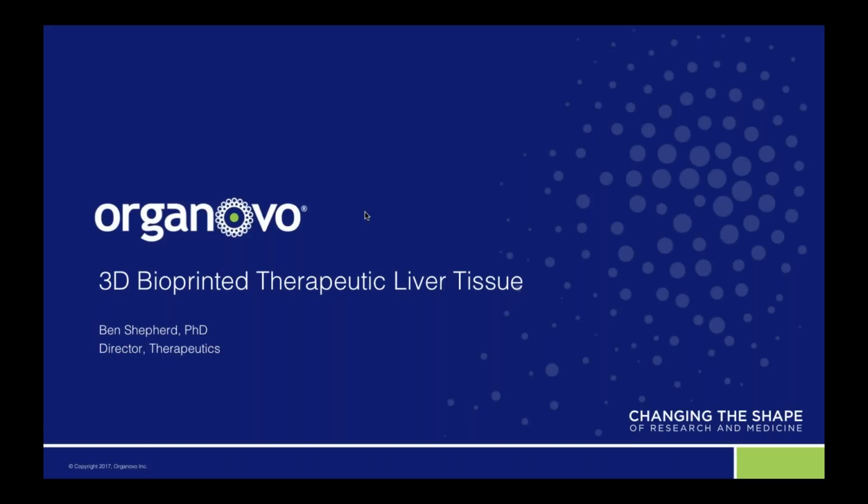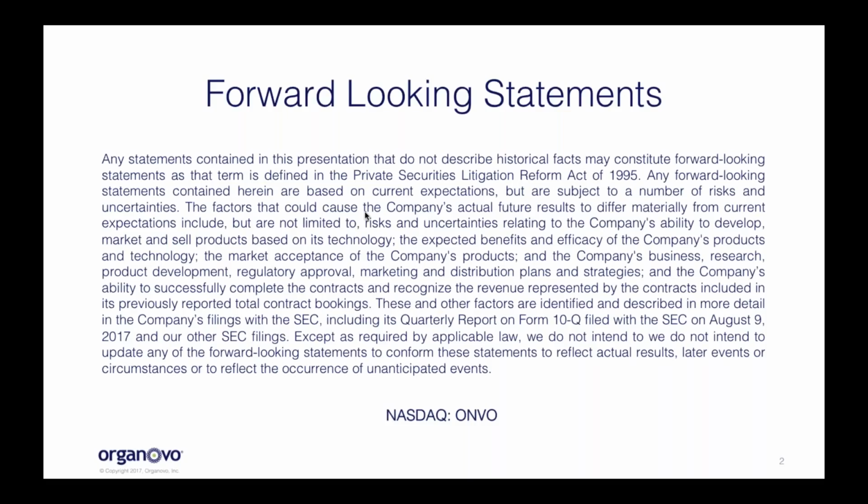So I'm going to walk people through a little bit of our transition from development of in vitro tissues that have been useful in the preclinical space and in the laboratory setting to efforts to develop and fabricate bioprinted tissues in the clinical space that would be useful for treating patients, and specifically patients that are suffering from end-stage liver diseases.